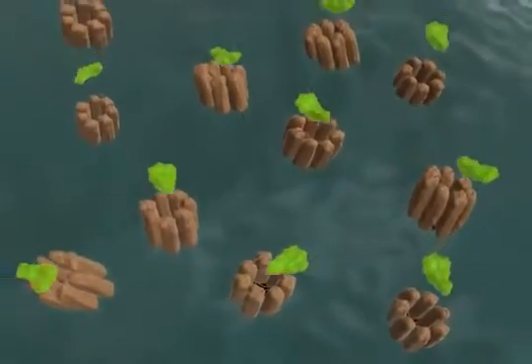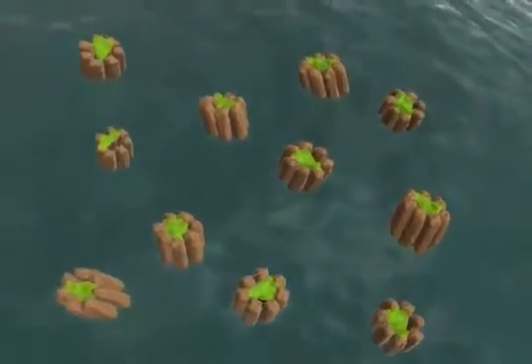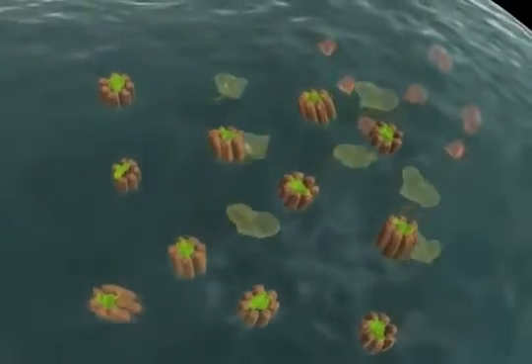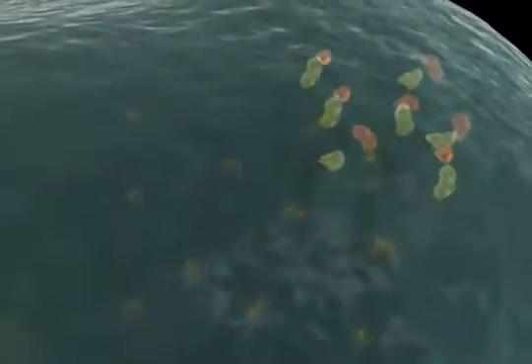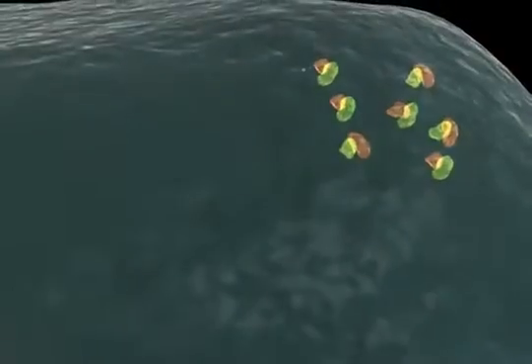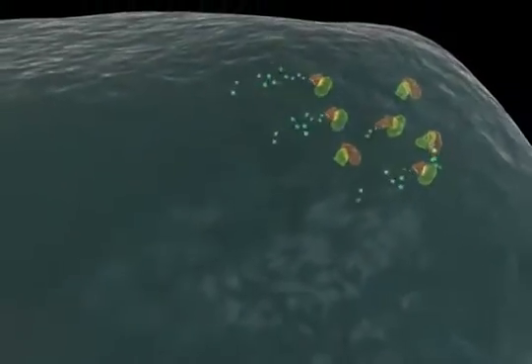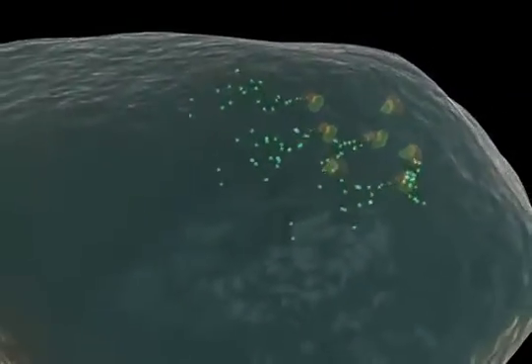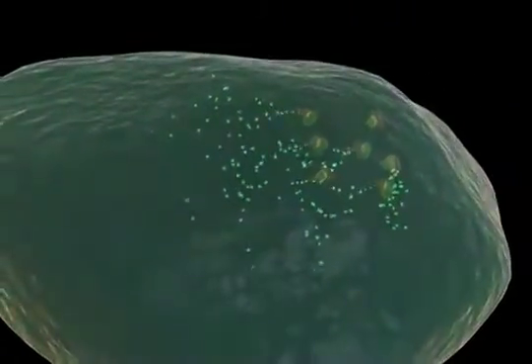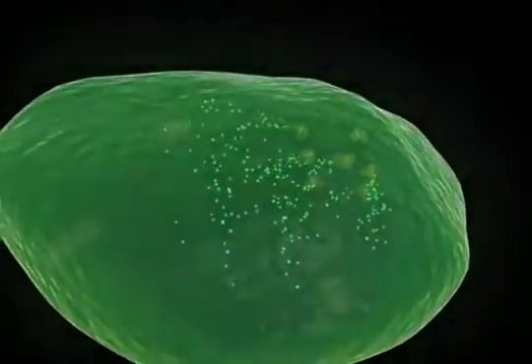Fast kinetic calcium flux assays can be performed using the FlexStation 3 system's integrated pipetter for detection of rapidly occurring cellular events.